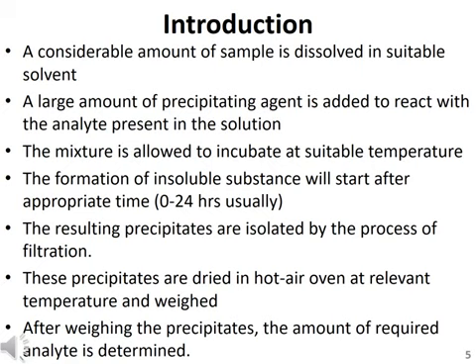So after preparing the solution, a large amount of the precipitating agent is added, which will react with the analyte present in the solution. And when this reaction is processed, as a result of the reaction, some solid particles will be formed.